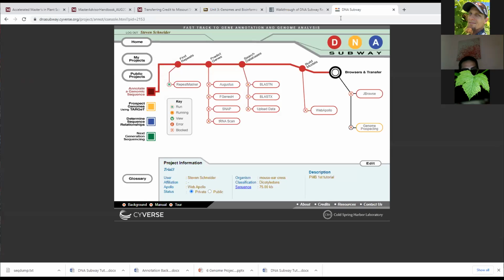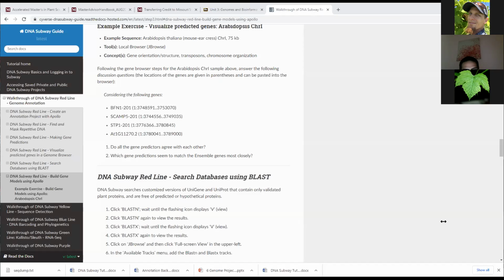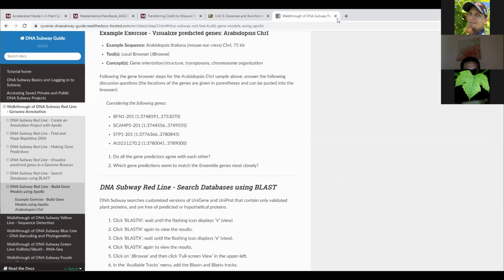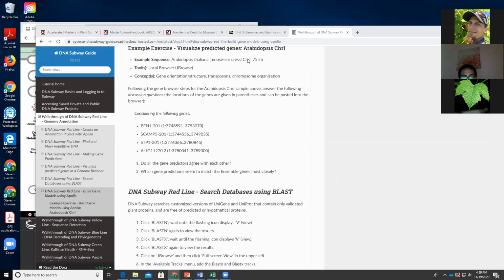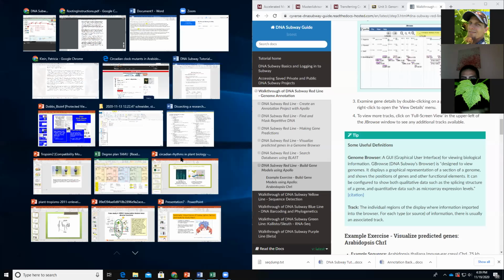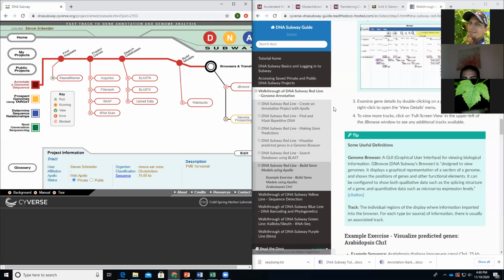And this is probably where you want to do a split screen. So pull that web page out. I don't know if you can still see that or not, maybe not. Anyway, go half and half screen. I'd have to share two screens. It's not allowing me to share two screens. I guess I could share my whole screen. There we go. I think my whole screen is being shared now. So then you can have the, can you all see that? Is that showing you side by side? Anyway, that's pretty much it.